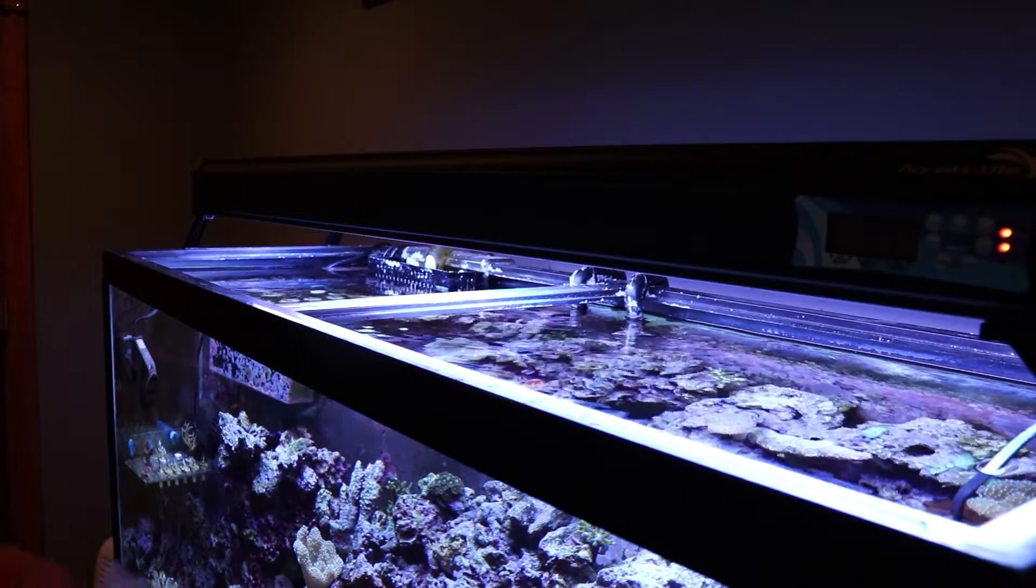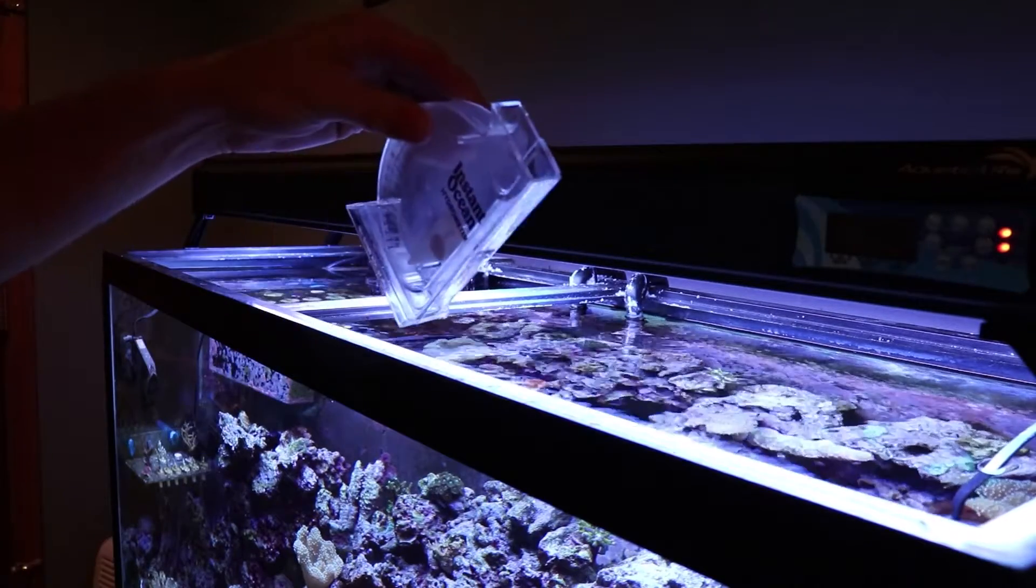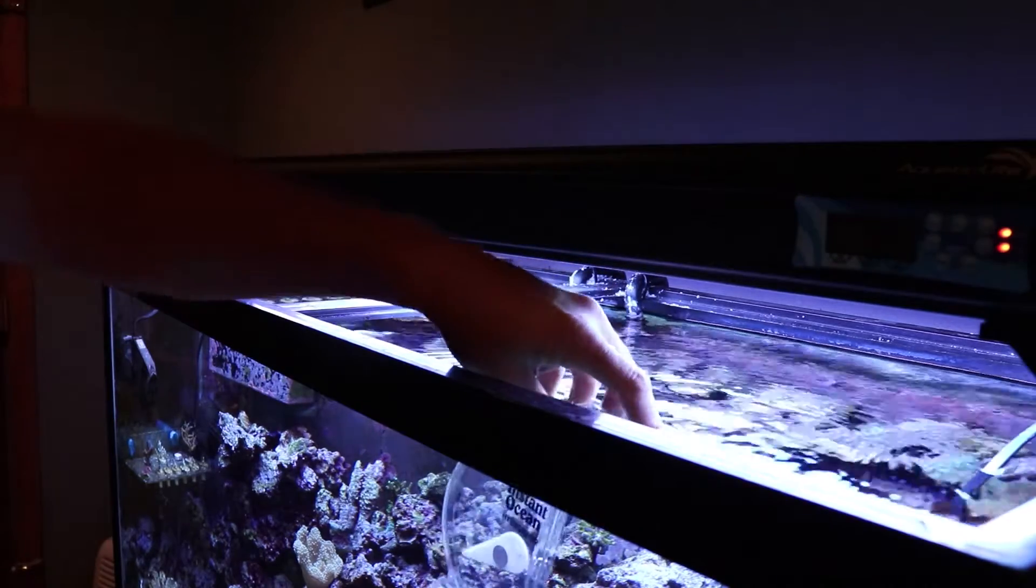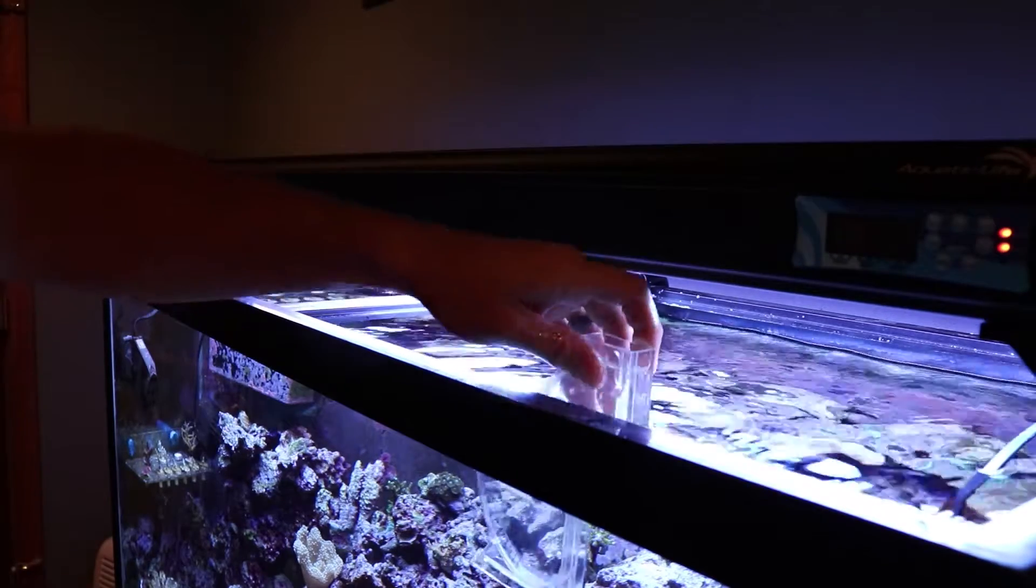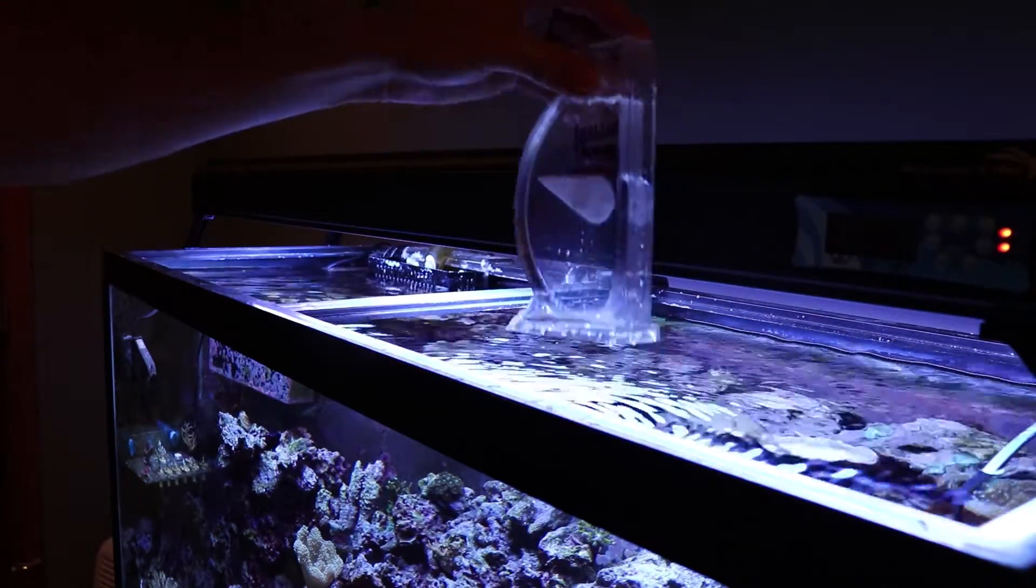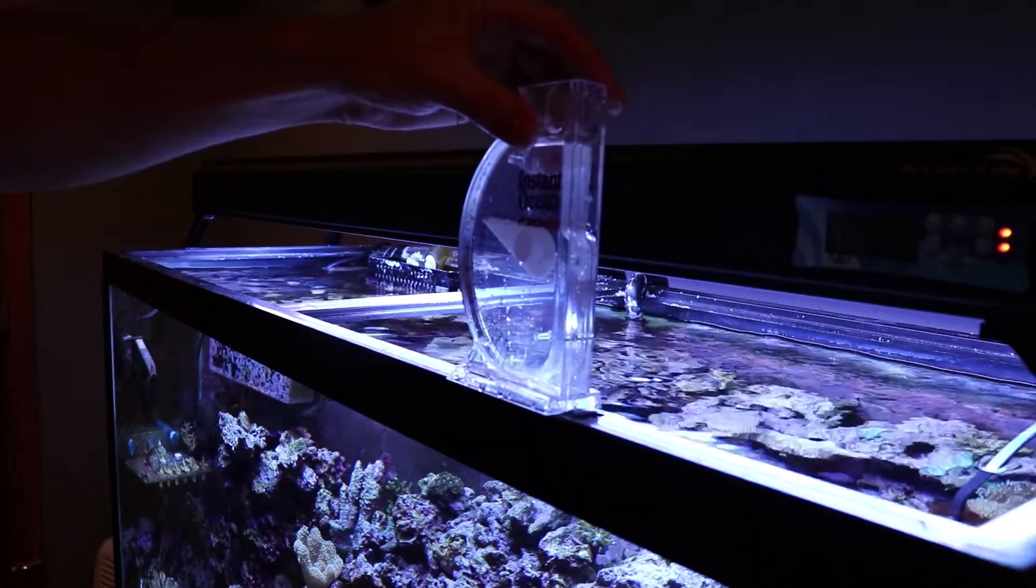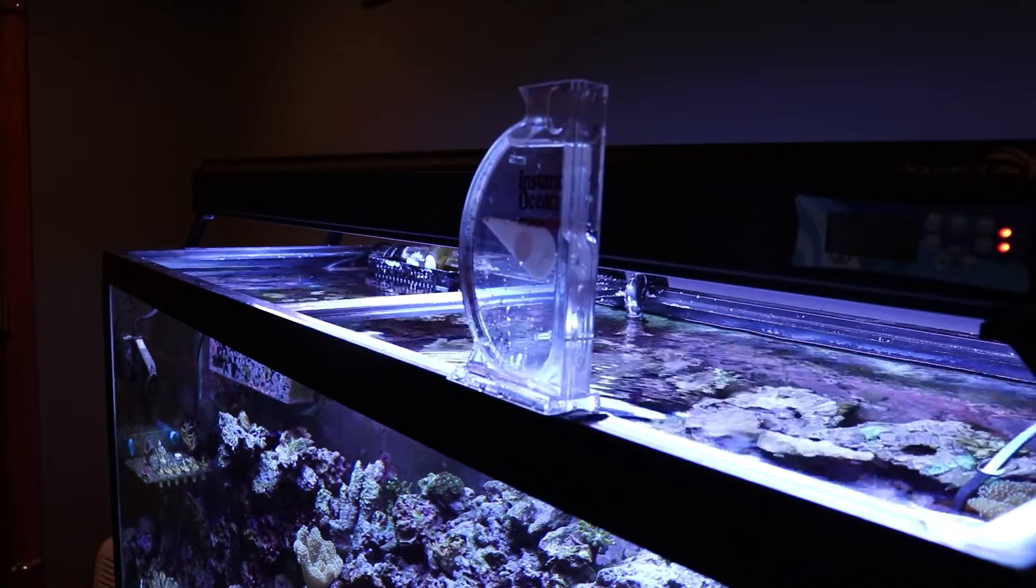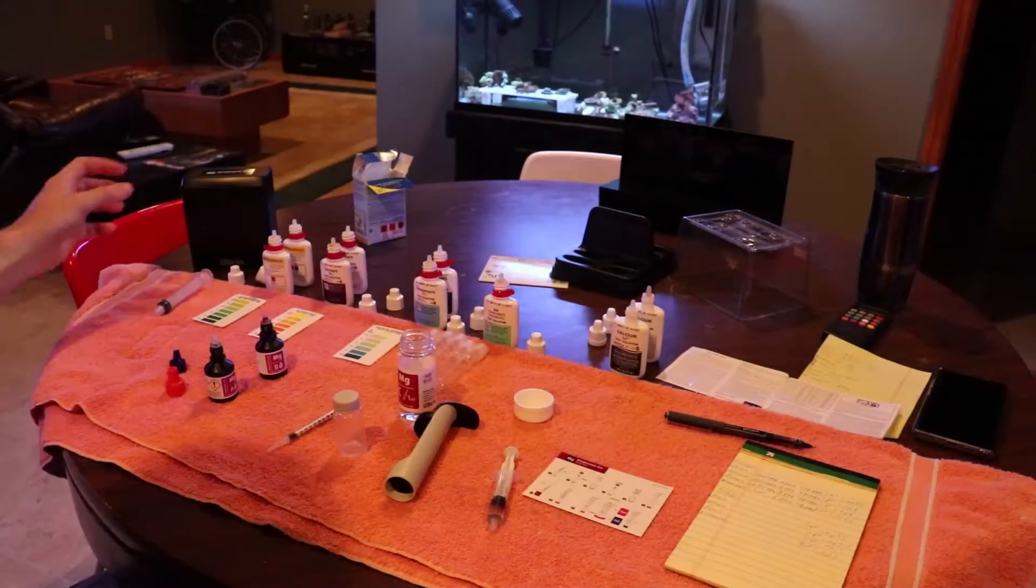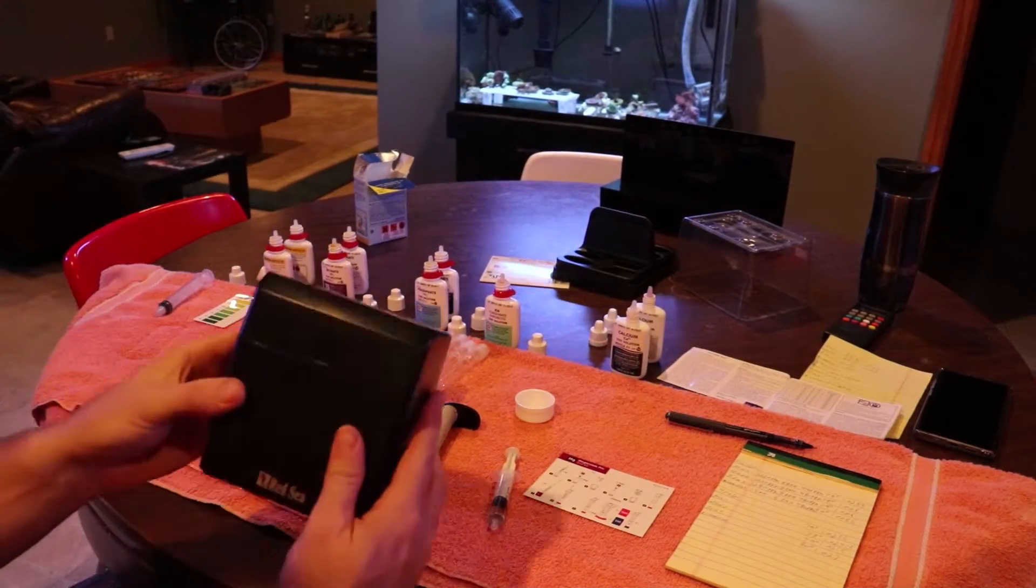Hello everybody, this is Chris with CNM Aquatics. Today we're going to go over the test kit I use on my aquariums and how to do it. First I'm checking the specific gravity, checking how much salt is in the water with the hydrometer. I try to keep my salt between 1.025 and 1.026. As long as it stays in that range and it's stable, I'm pretty happy with that.